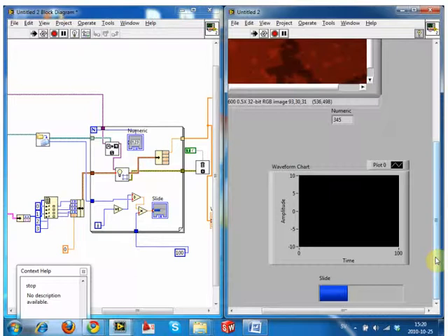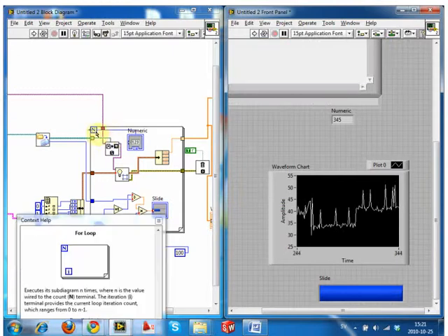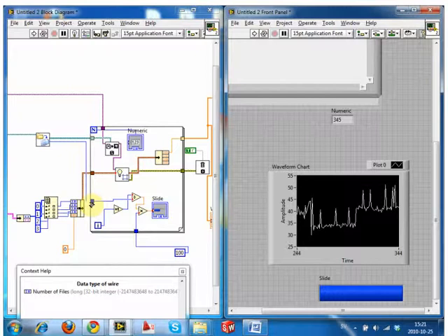I wouldn't actually do it that way, because it's not efficient. Because you're now reading a function inside of the loop. You want to do it from the outside, so then it becomes a constant. If you have the option, you want to have all your constants outside of the loops. You never want to have something of a constant value being read inside a loop, because it's having to read that to a variable, essentially.